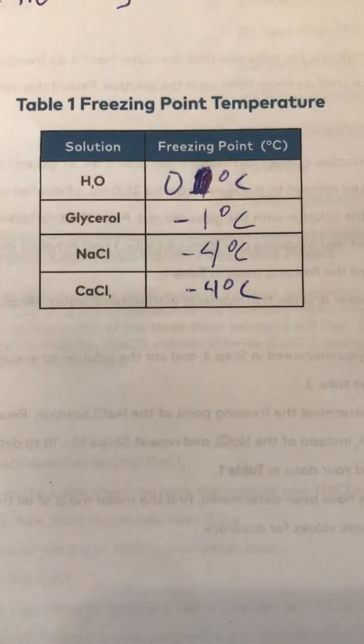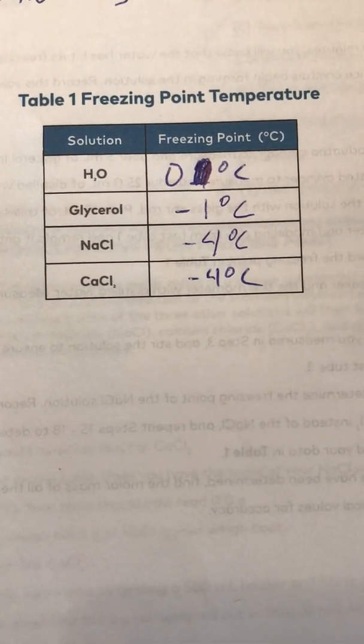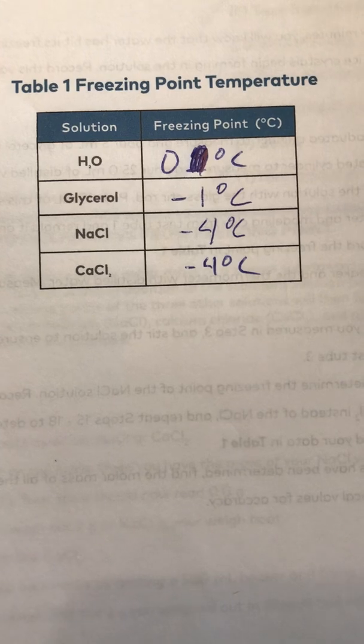Doing the test tubes. It took a while for the results on this one. There's the table. Those are for the water. I got 0. Glycerol, I got -1, -4, -4. For the temperatures when they started to freeze. So I thought those turned out all right.